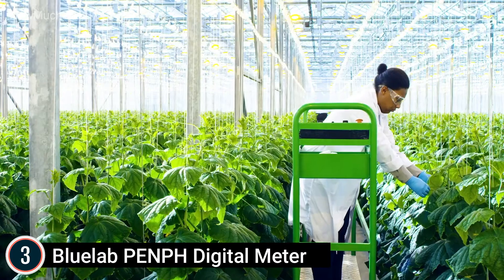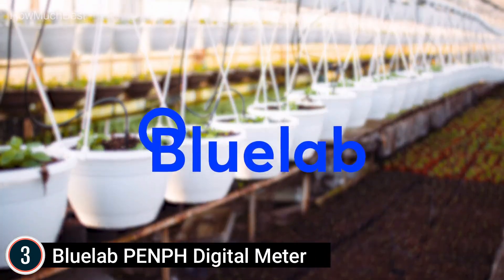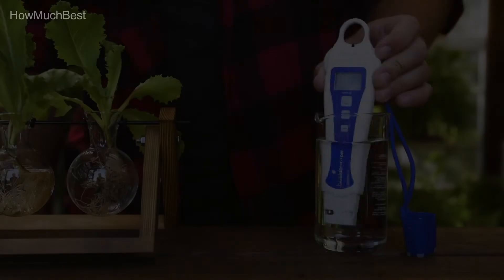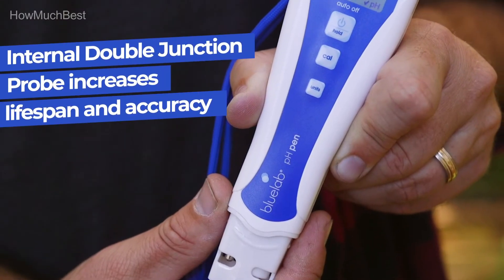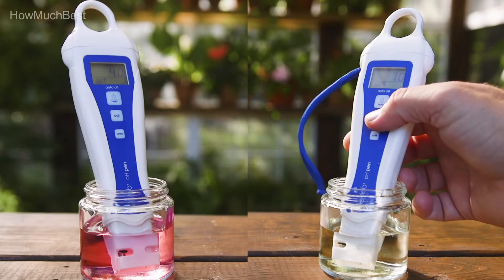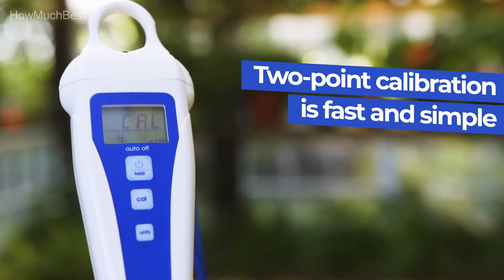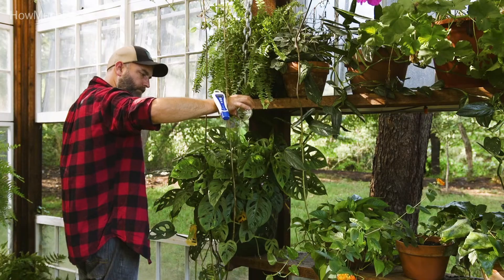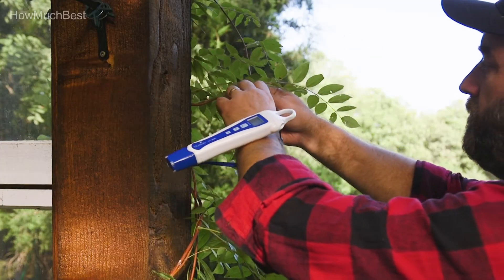It integrates with PPM meters for complete indoor garden nutrient monitoring in water and soil. Other features include auto-off function, low battery indication, and units for temperature. The set includes an AAA battery, lanyard, and calibration solution. pH plays a pivotal role in making nutrients in your solution soluble so that they can be accessed by your plants. To help your plants grow, get the basics right by measuring pH and temperature to make sure these are always within the optimal range. Products are designed and built with growers, for growers, so your pen can withstand the knocks, drops, and deep water plunges that come with daily growing.